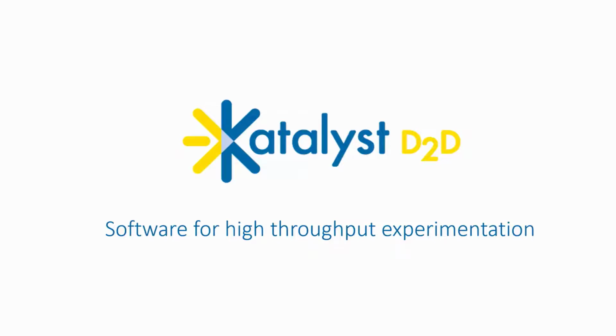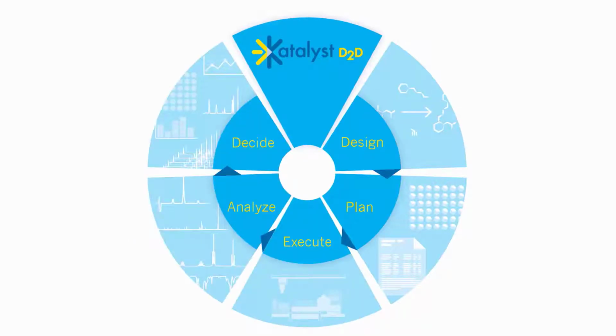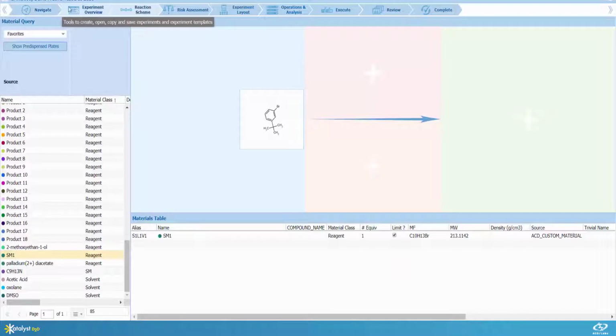Katalyst is a web application designed for high-throughput chemistry, allowing you to design a reaction, define the procedural steps to execute the reaction, and associate analytical data to evaluate the reaction. The chevrons across the top of the screen represent the workflow for the application. Chevrons can be added, deleted, or customized to fit your workflows.